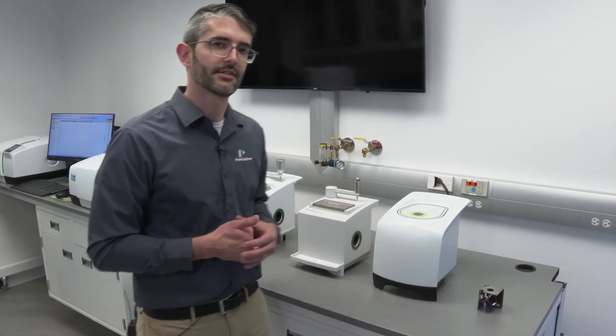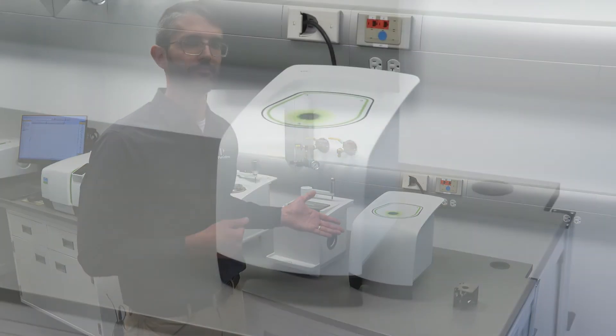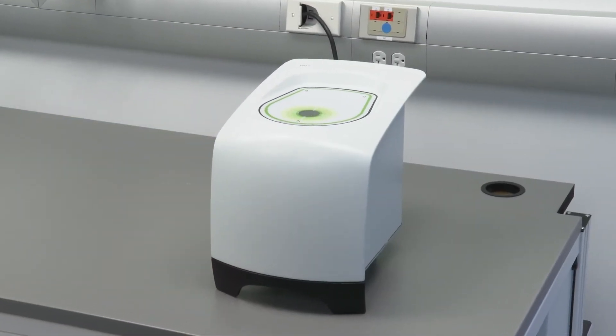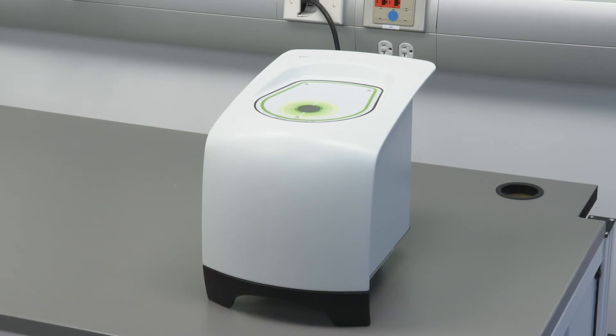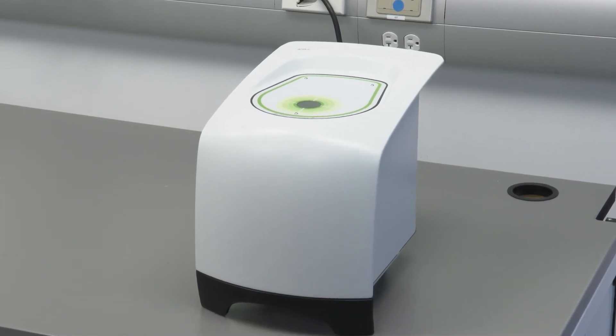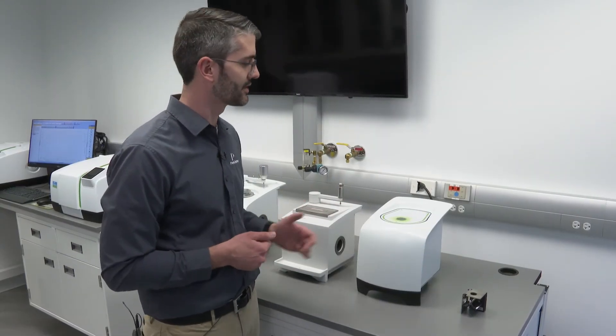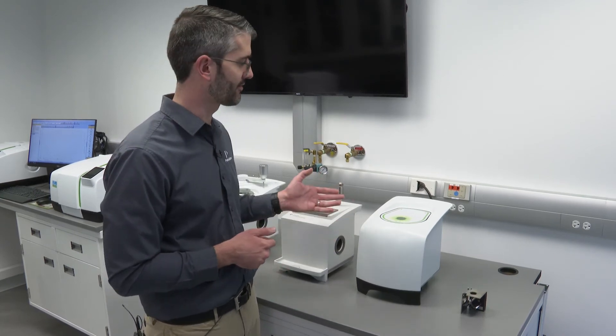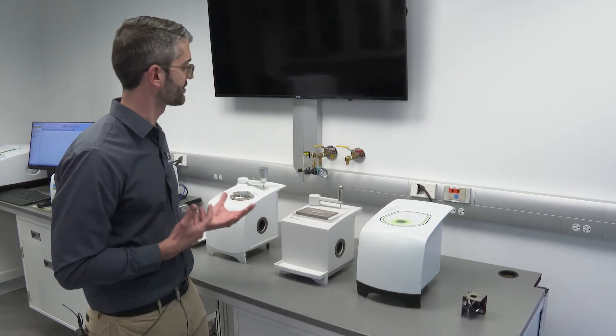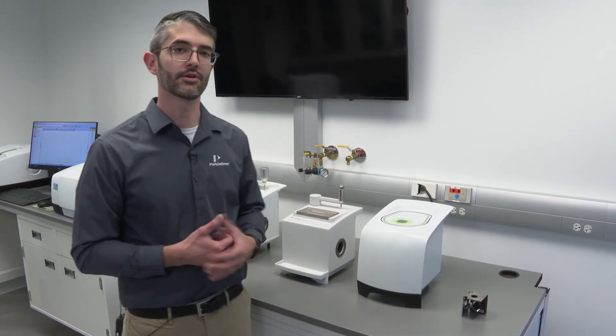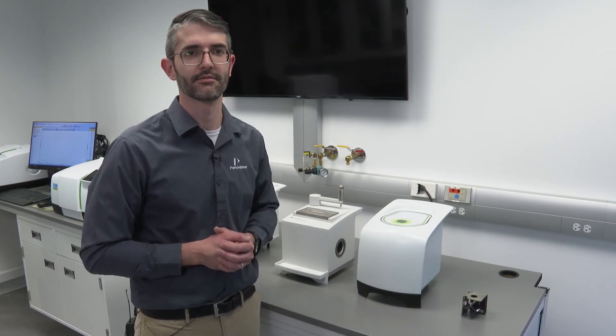For solids analysis, oftentimes diffuse reflectance is employed. Here we see a near-infrared diffuse reflectance accessory. Diffuse reflectance allows the infrared light to travel through a large volume of sample and allows a more sensitive measurement and a more holistic measurement, which represents a wider volume of material. This can be preferable in situations when a very non-uniform sample must be analyzed, or in situations where some of the other sampling techniques are either not as easy or don't provide the required level of detail and information from the analysis.